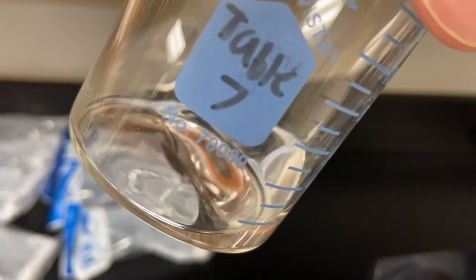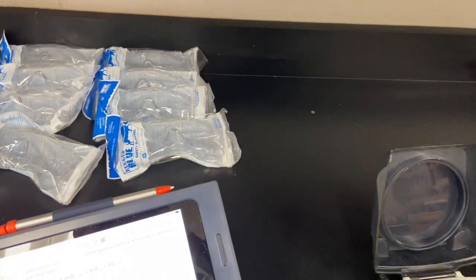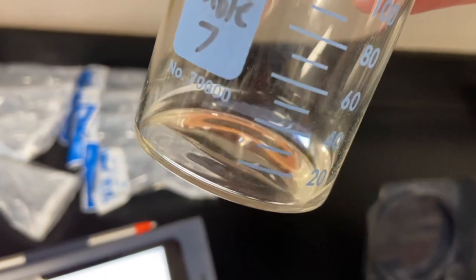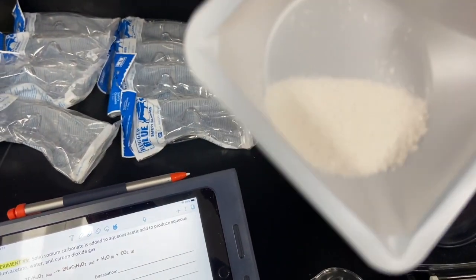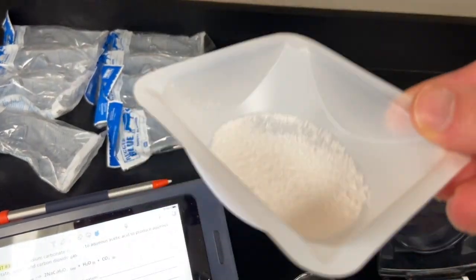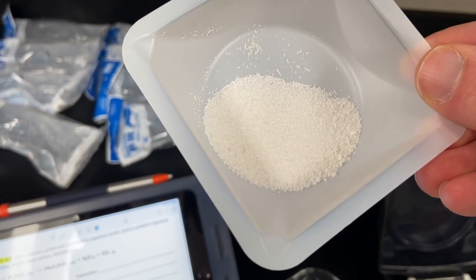This is vinegar. Okay. Here is vinegar. Make your description of vinegar. And if I just give it a little whiff, it's got a nice sour smell to it. Okay. And then this is sodium carbonate. Sodium carbonate. So go ahead and make your descriptions of sodium carbonate.